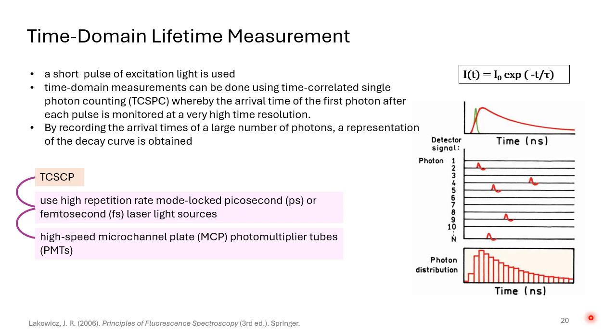Now we will wait for all the molecules to come to the resting position, like it was before the excitation. After all the molecules come to the ground state again, like before the excitation, we give the second pulse, and then again it will excite some molecules, and the moment the excitation starts, the machine will start to record the time.